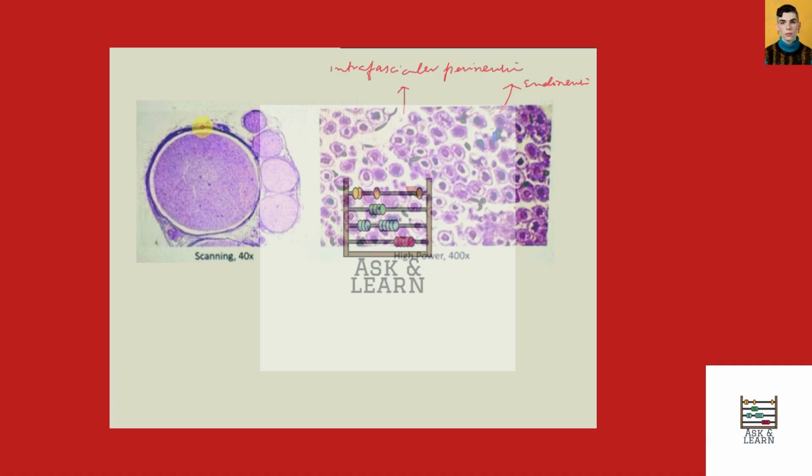As we know that the outer layer represents the perineurium, while the layer inside it represents the endoneurium, which is visible only in high power resolution.